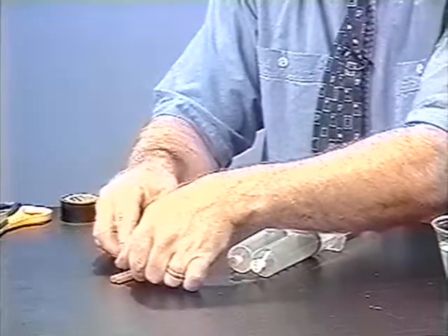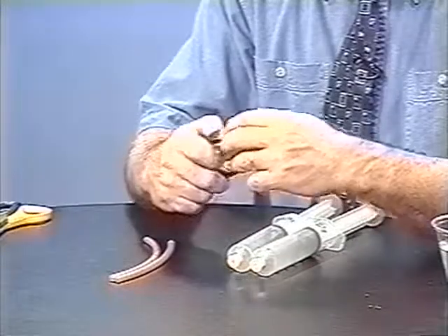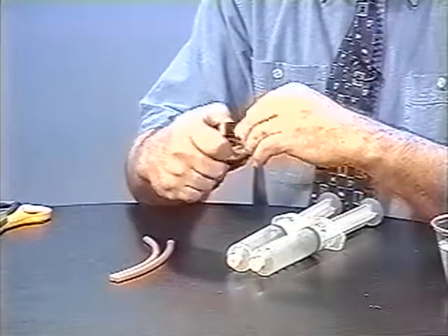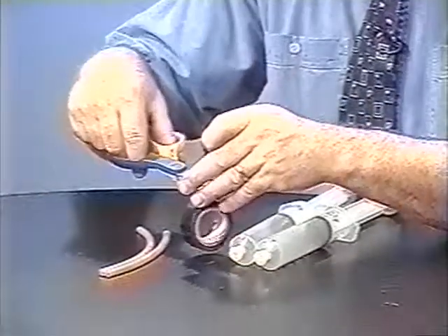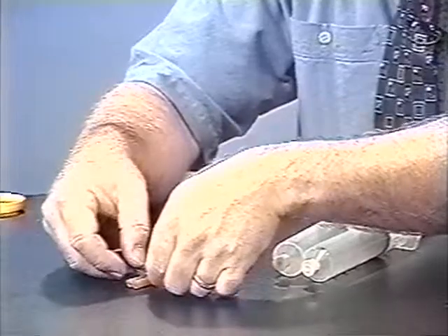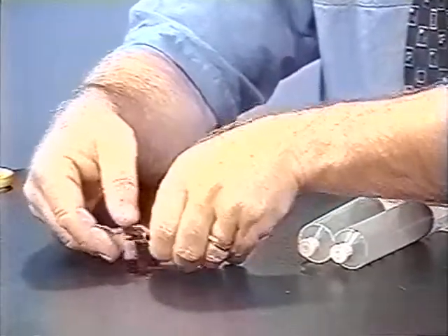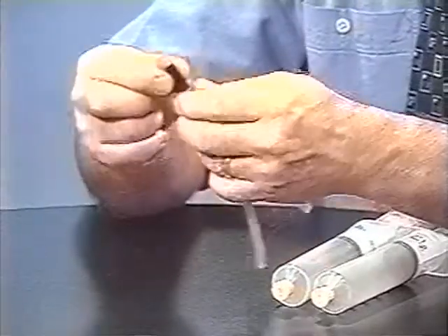To do that, to make sure they are able to mix, I'll just take and tape the two pieces together with a short length of electrician's tape, or any waterproof tape will work, so that the ends of the latex tubes are side by side.